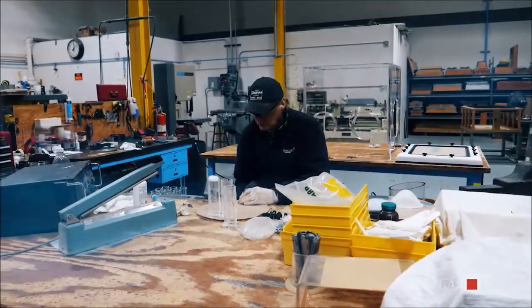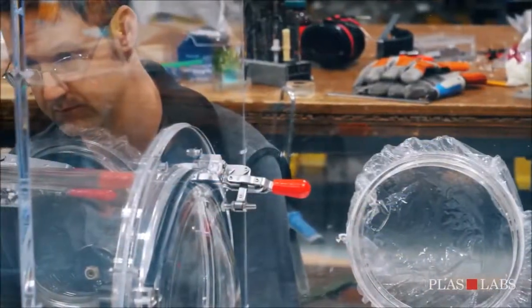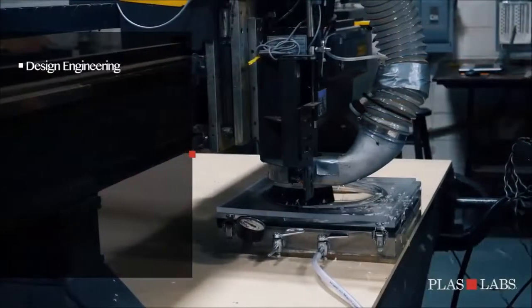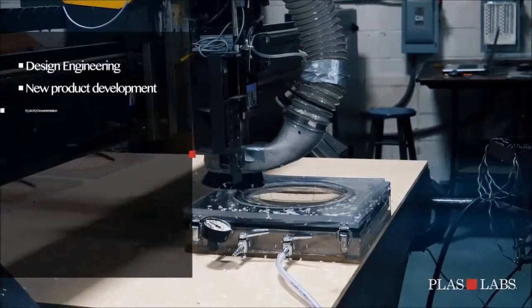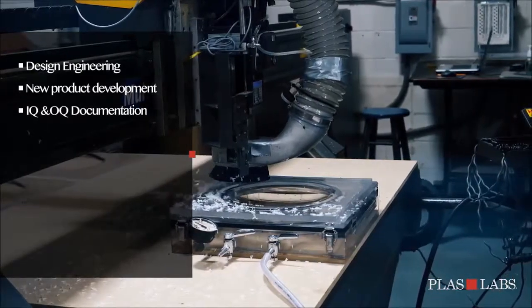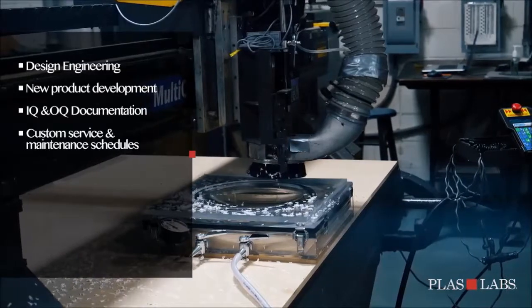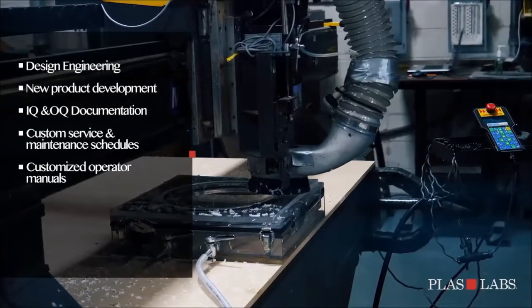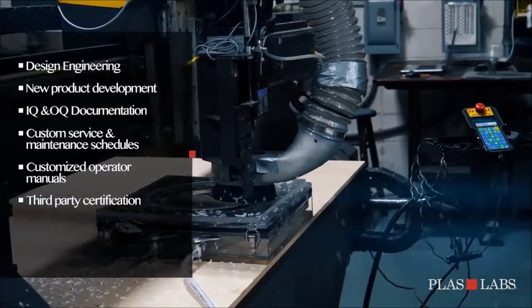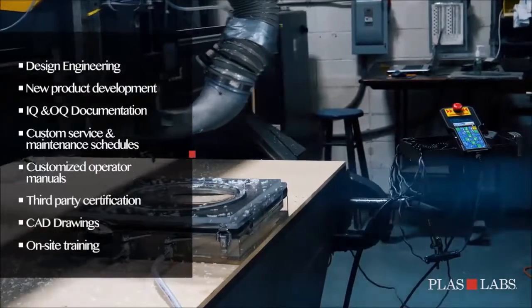Plaslabs is committed to providing high-quality research equipment at a fair price. We realize unique research protocols require individualized equipment. We offer the following special services: design engineering, new product development, IQ and OQ documentation, custom service and maintenance schedules, customized operator manuals, third-party certification, CAD drawings, and on-site training.